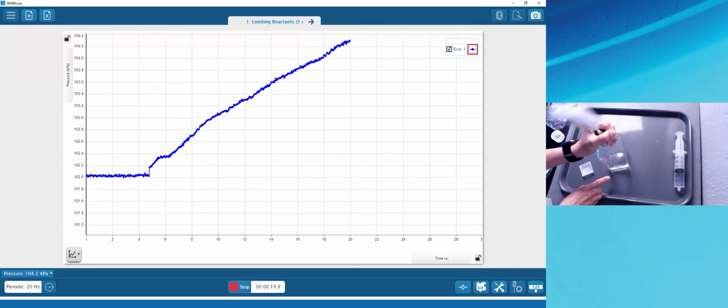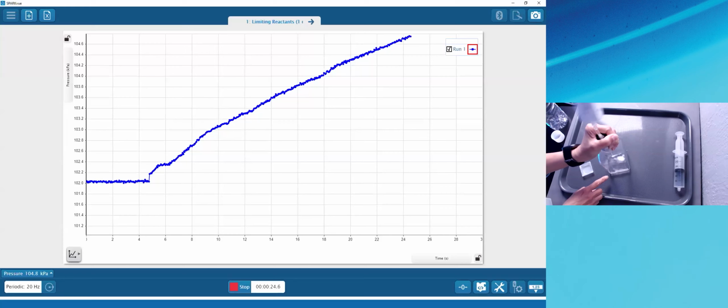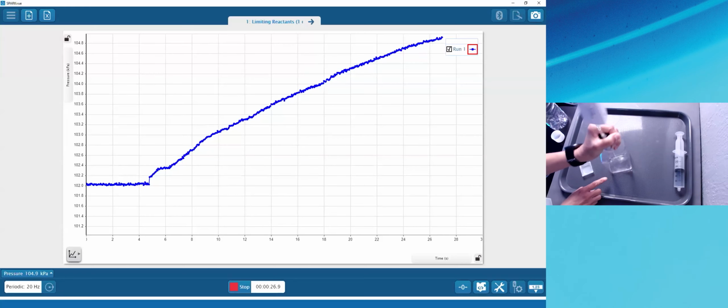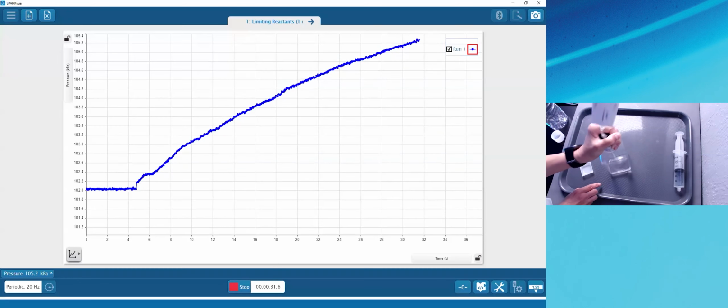I'm going to observe my swishing and make sure that it's effective and note how fast I'm going because I want to try to replicate this exact speed on all the runs. As lab partners work together, they're remembering these things and we're watching the data go.